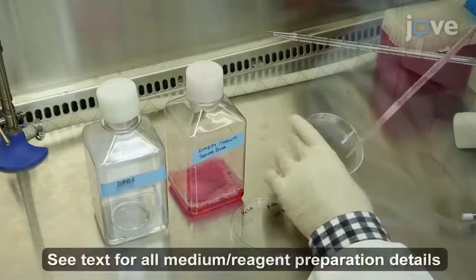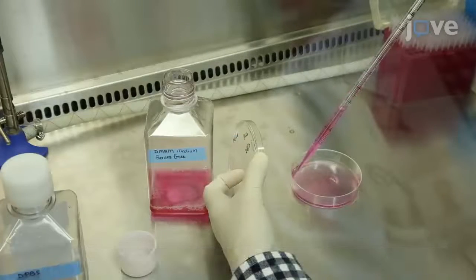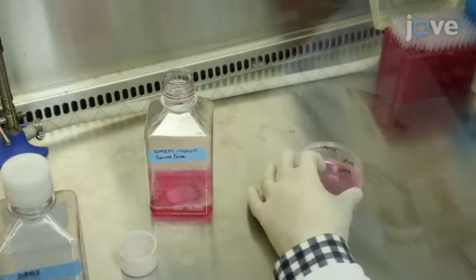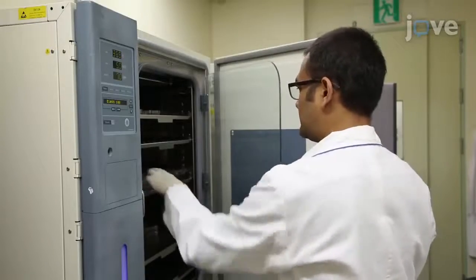When a 100 mm dish of HeLa cell culture reaches confluency, replace the supernatant with 10 mL of HeLa cell culture medium without FBS and return the dish to the cell culture incubator.